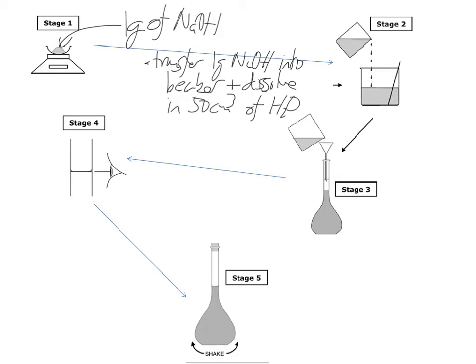We're then going to take our beaker and we're going to transfer the liquid through a funnel into a volumetric flask. And when you're answering exam questions on this, you must talk about the apparatus required. So we're going to use a 250 centimetre cubed volumetric flask. You need to note down the apparatus name. This is a volumetric flask and we're going to tip the liquid from this beaker into our volumetric flask.